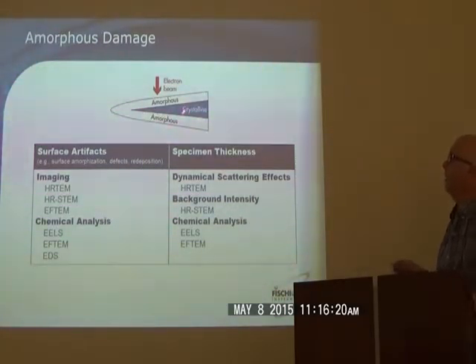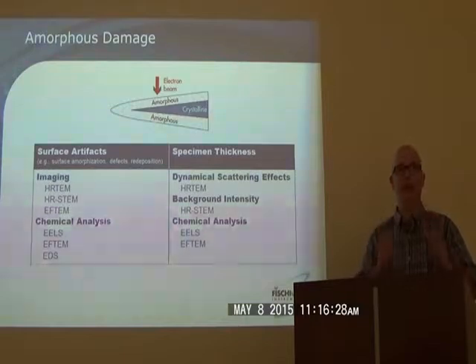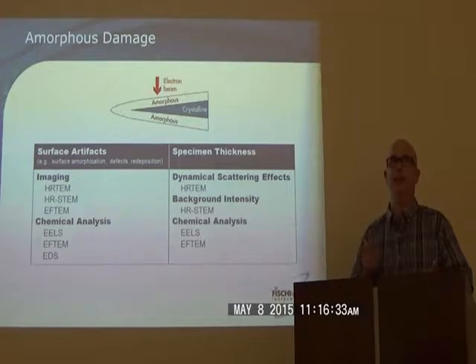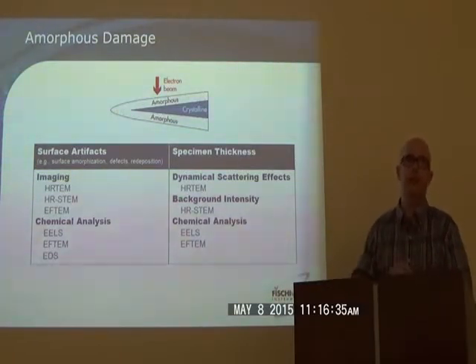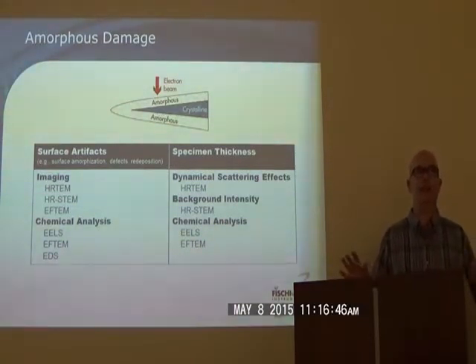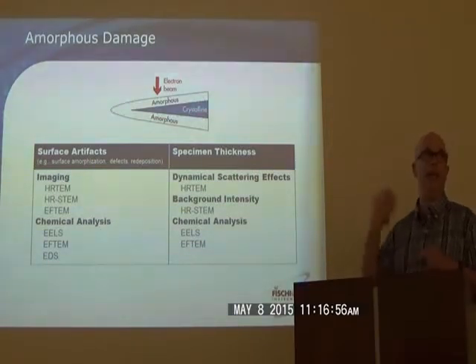Amorphization. Now, let's say that we've designed, as with all these great engineers I know we do every day, very, very well thought out ion milling devices, and we're not worried anymore about excessive ion energies, excessive temperatures, a lot of the things that we've now limited or done without. Well, there's one problem that remains that is just due to the physics of the sputtering process that we probably can't necessarily eliminate, but we could almost eliminate. We could minimize it greatly. And that's how much residual amorphous damage we have on any material.